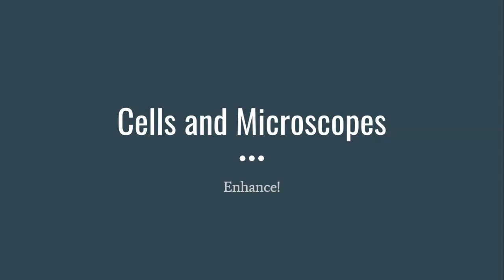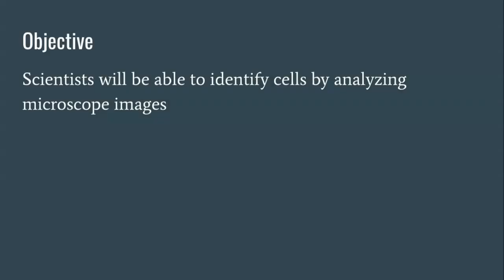Cells and Microscopes. In this video, scientists will be able to identify cells by analyzing microscope images.